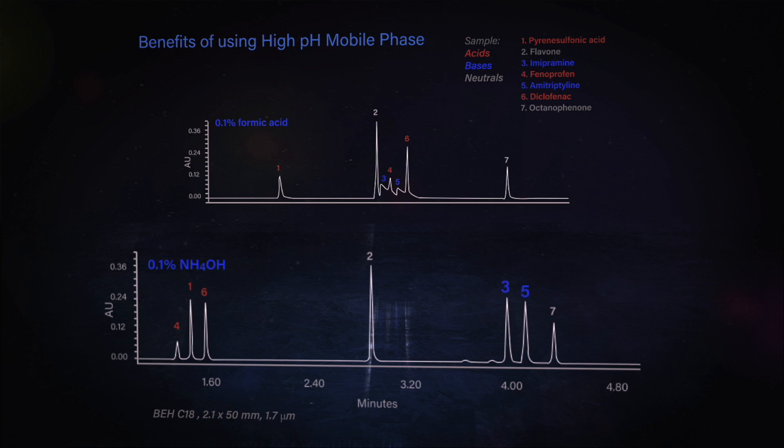Where the basic analytes now, they're becoming unionized or more hydrophobic, and they're getting much better retention. And because they're unionized, they don't have that shark fin-like peak shape. And peaks two and seven, since they're neutral, they don't move no matter what the pH is, as you'd expect.